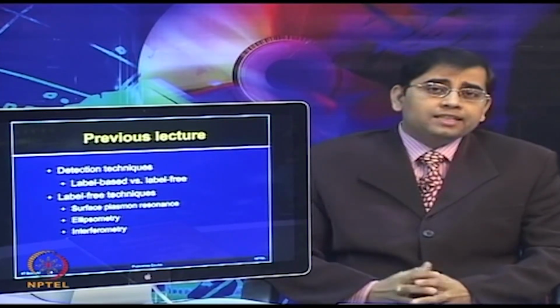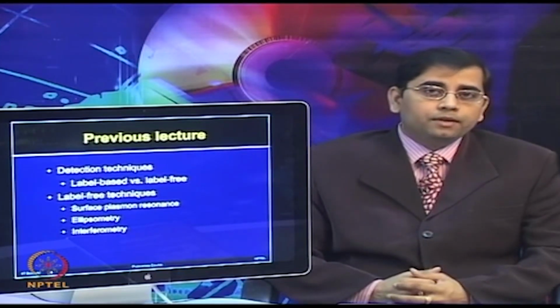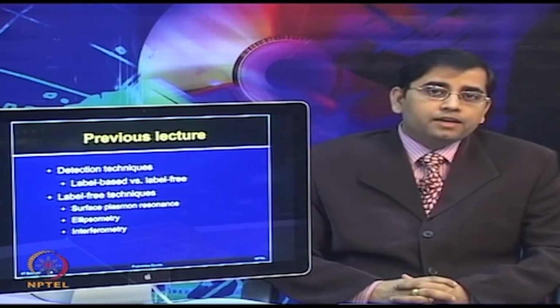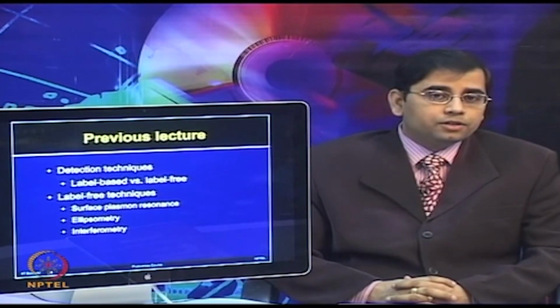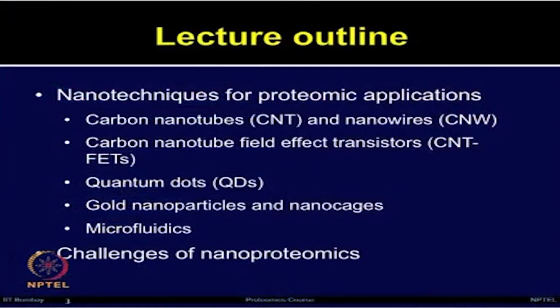interactions. The successful integration of nanotechnologies with proteomics has now introduced a new field in this clinical research area known as nanoproteomics. This is one of the very rapidly emerging areas for biomedical research, which may ultimately have tremendous therapeutic potential. So, in today's lecture, we will talk about different nanotechniques which are applied for proteomics applications.